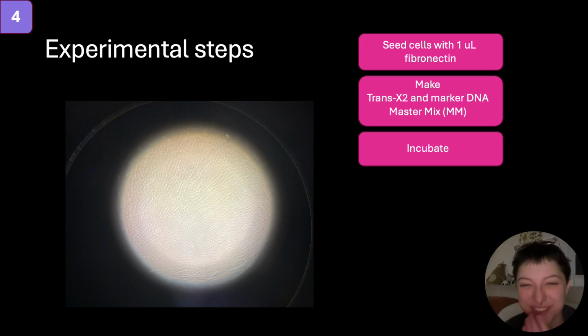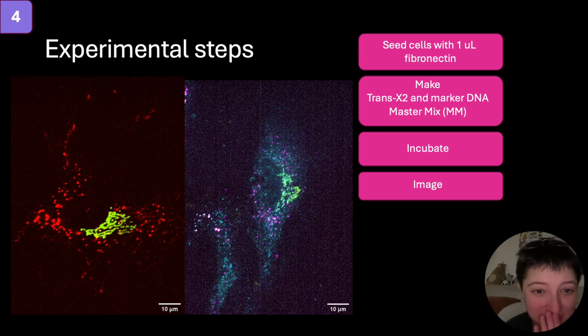And yeah, I learned how to basically take care of cells, and before you can make a movie and add SLF and see the transfer happening, you need to find a good image.